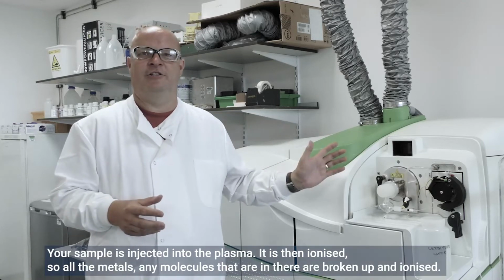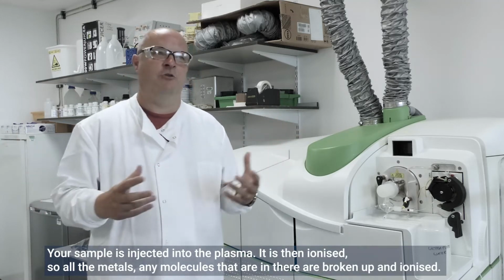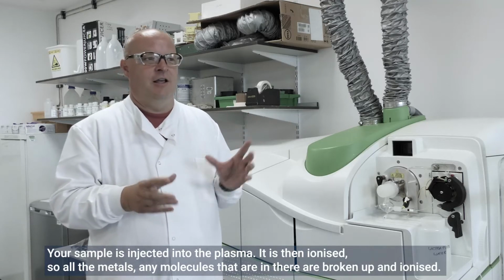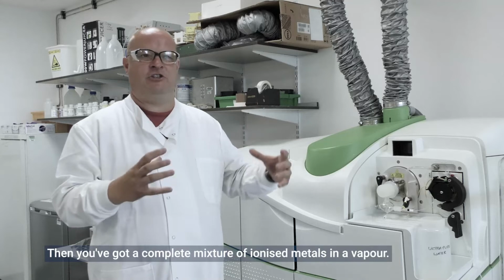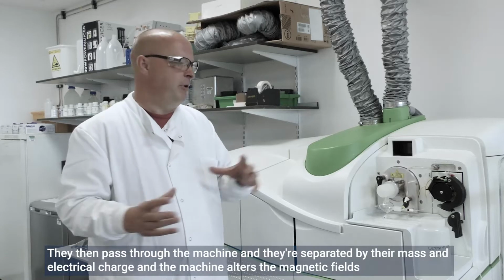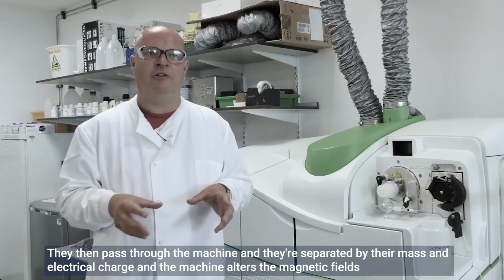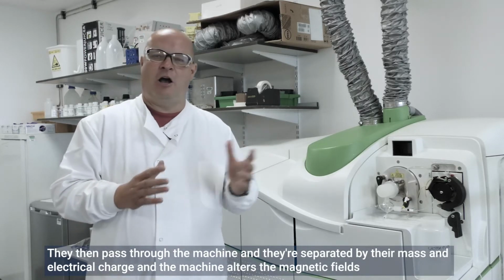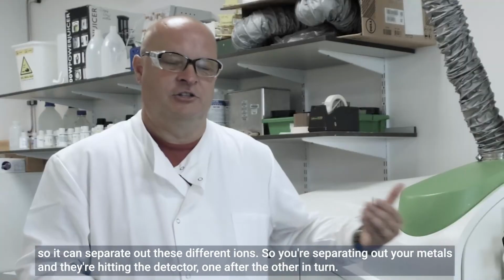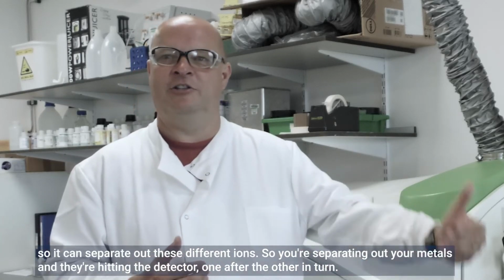Your sample is injected into the plasma. It is then ionised, so all the metals, any molecules that are in there, are broken up and ionised. So you've got a complete mixture of ionised metals in a vapour. They then pass through the machine and are separated by their mass and the amount of electrical charge on them. The machine alters the magnetic field so it can separate out these different ions. So you're separating out your metals and they're hitting the detector one after the other in turn.